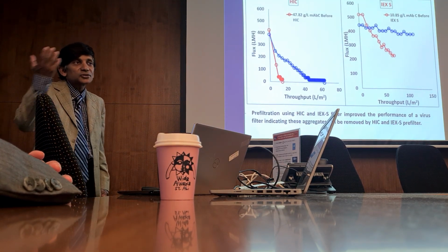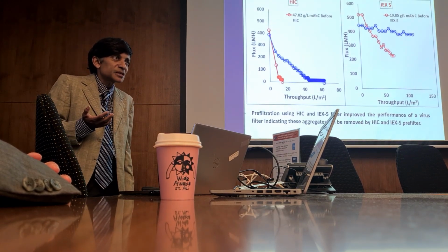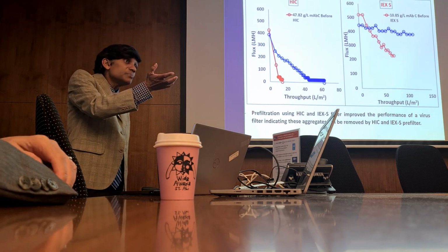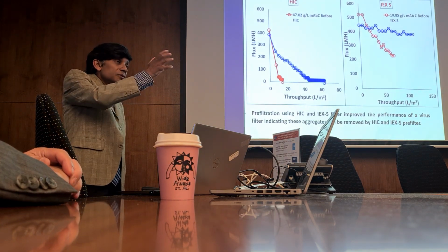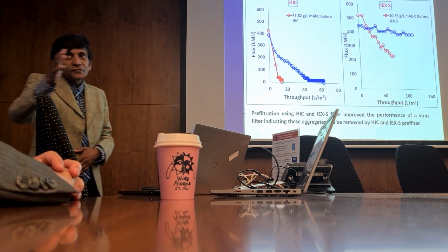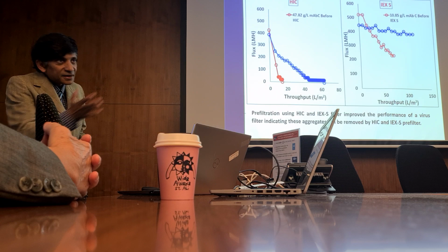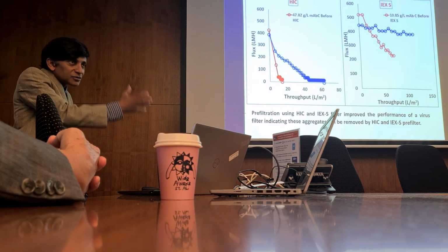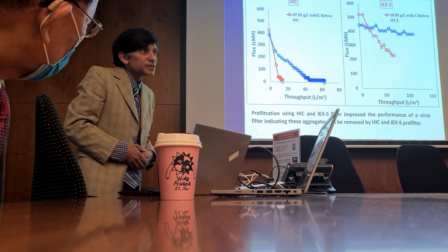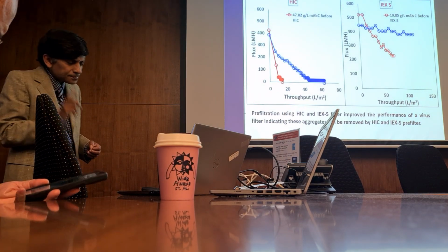And that gets back to this whole idea of trying to do continuous biomanufacturing, because that would be much more gentle. The feed pump actually causes a lot of shear. If the protein goes through that once, enters the module once, then the rest should be uniform, and then it comes out and you collect it, it goes to the next process. If you are running around in a circle, you keep going back to the feed reservoir, and that leads to much more shear. So that's one very good point, and yes, this is very important.